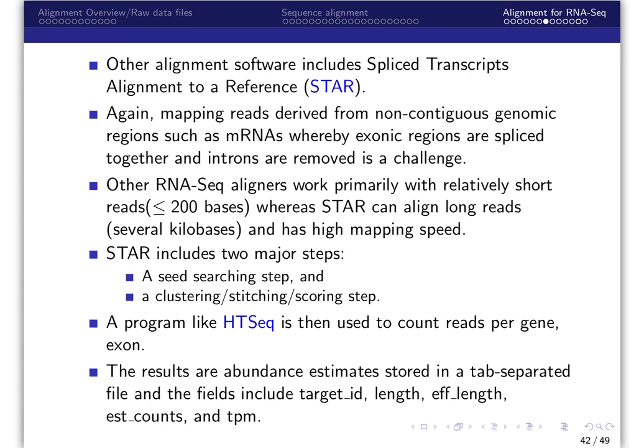The seeds are then clustered together by proximity to a selected set of anchor seeds, and all the seeds that map within the user-defined genomic windows around anchors are stitched together, assuming a local linear transcription model. The stitching is guided by a local alignment scoring scheme with user-defined scores for matching and penalties for mismatches and gaps. The stitch combination with the highest score is chosen as the best alignment of a read. The output from STAR is a SAM file.